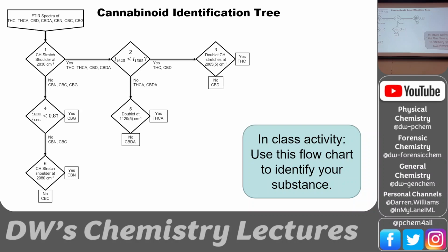Yeah, because we're looking at this shoulder here, 2830. That's the difficulty of these flow charts. Yeah, you got a shoulder there.